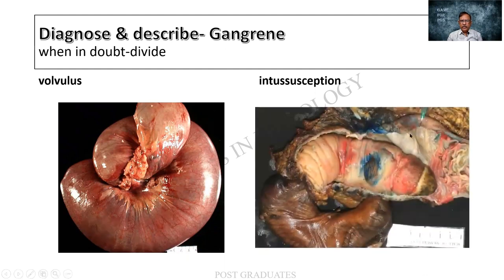This is it. So I find that there is an intussusception, a loop within a loop. This will commonly happen when there is one area which is aperistaltic and another area which is aggressively peristaltic. So one loop, the proximal, will be going into the distal one, and it is called the intussusceptum, and this is the intussuscipiens.